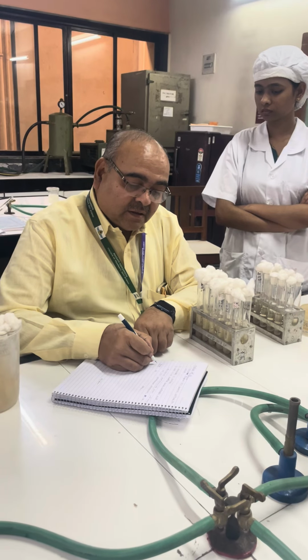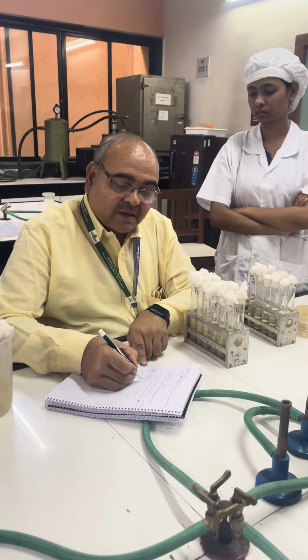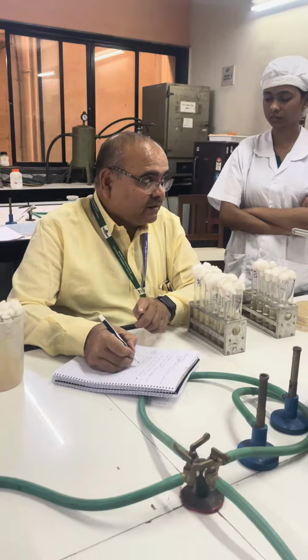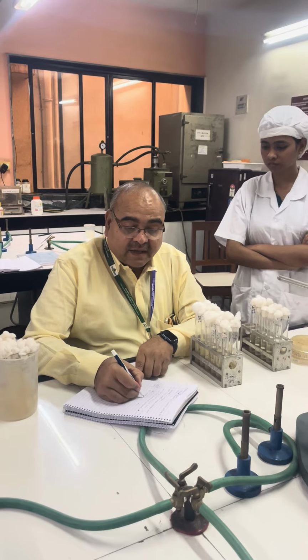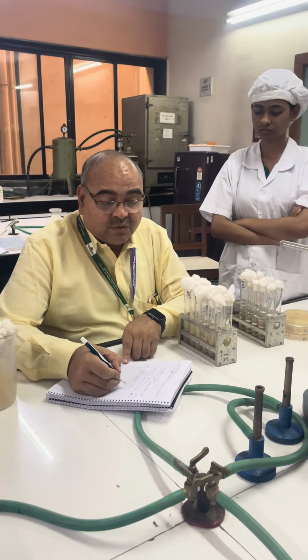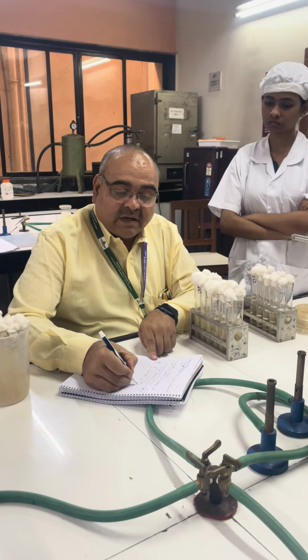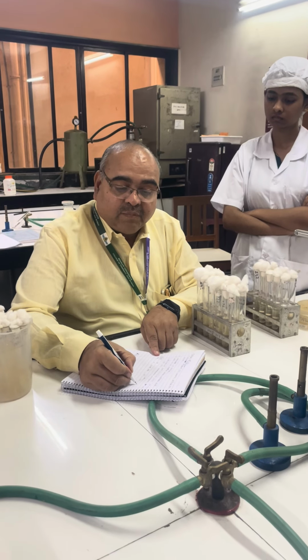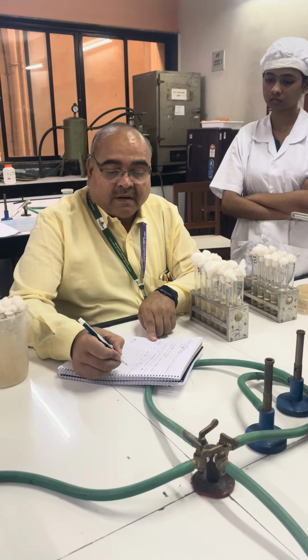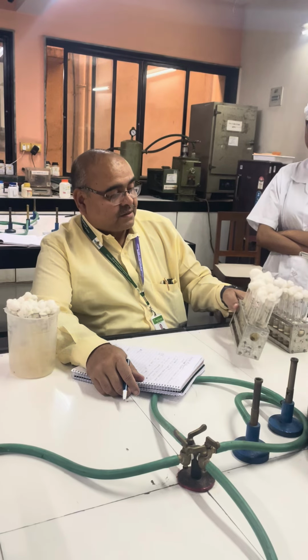W1 is 3 test tubes of 10 ml, 3 test tubes of 1 ml and 3 test tubes of 0.1 ml. I told you to xerox the MPN table from the book. In the similar way, 10 ml, 1 ml and 0.1 ml for the corresponding MPN. Now here the number of test tubes.